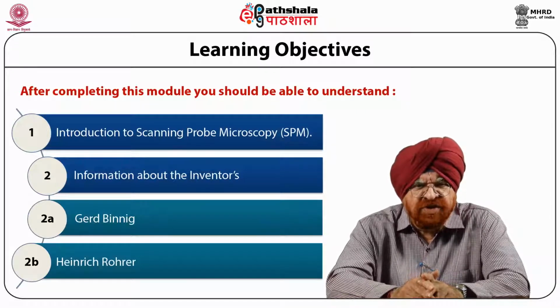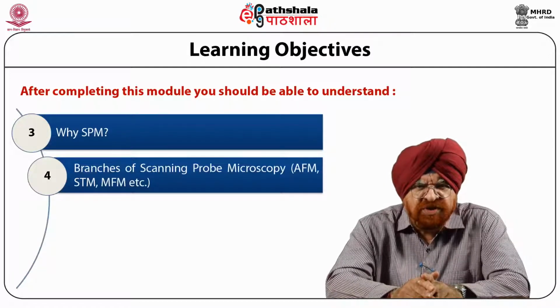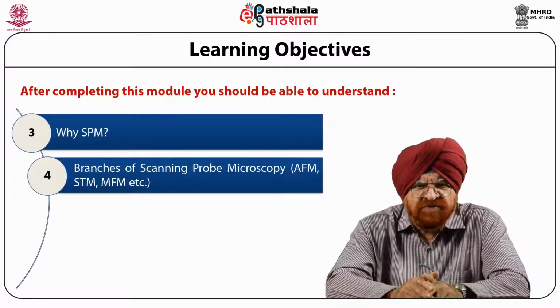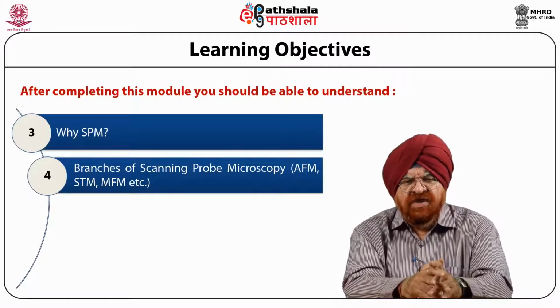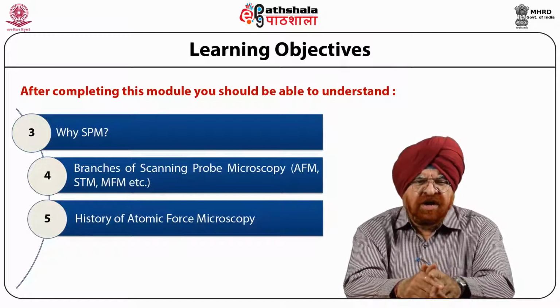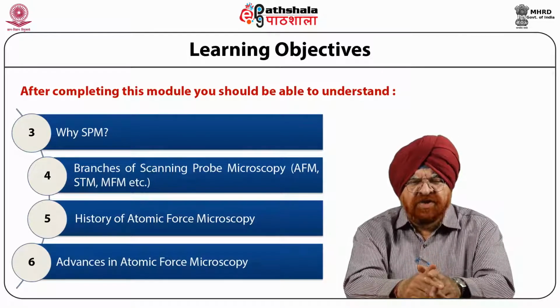We'll continue with this. Why SPM? Branching of scanning probe microscopy: it's a branch, but techniques like AFM, STM, MFM, etc., all come under this category. Then, what is the historical background of atomic force microscopy? And lastly, the advances which are there in the AFM technique.